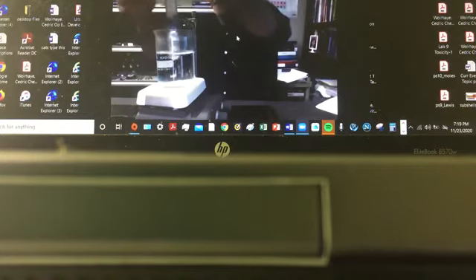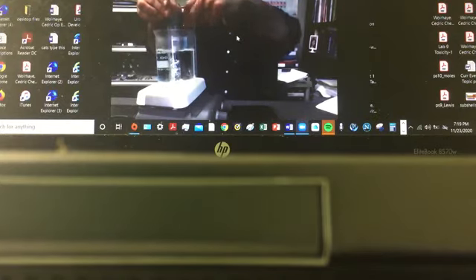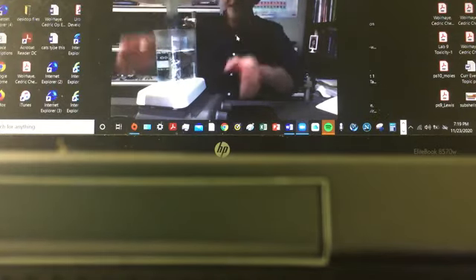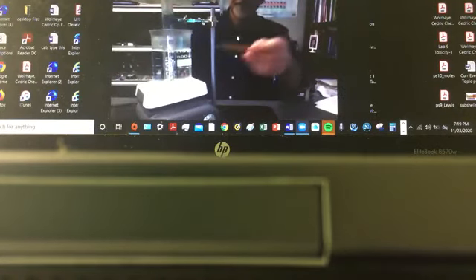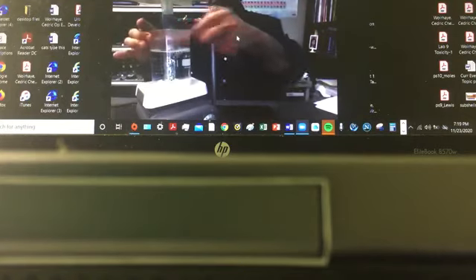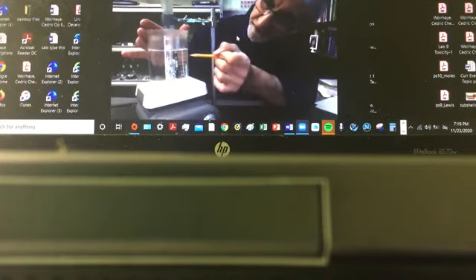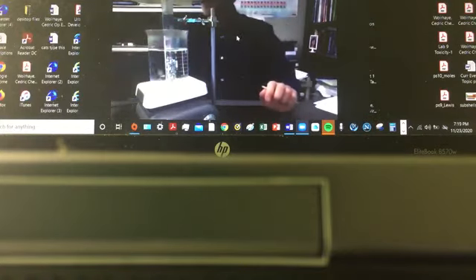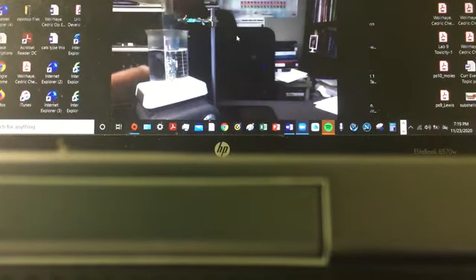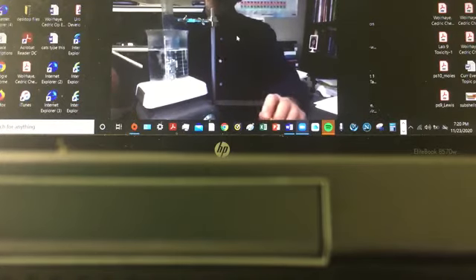So I'm going to submerge it inside the hot water and keep it suspended. Notice the hot water completely covers the metal. So here's the level of that metal, and the hot water should be above that level, just to make sure all the metal is heating up. I don't want to predict that the hot metal is the same as the boiling temperature, 100, but I want to measure it.